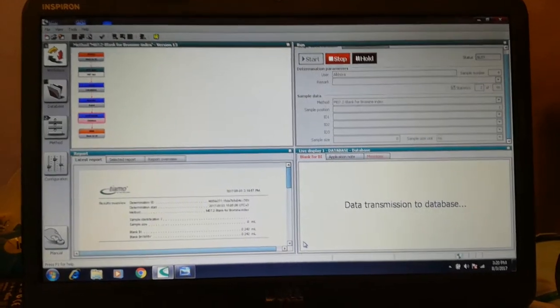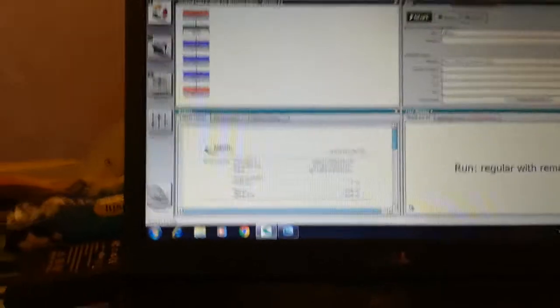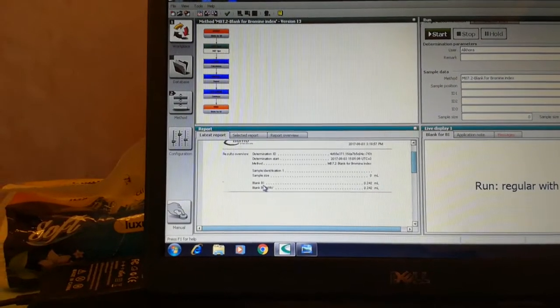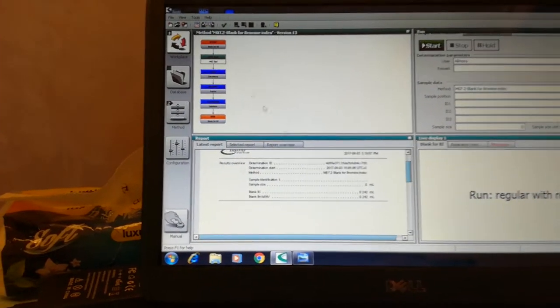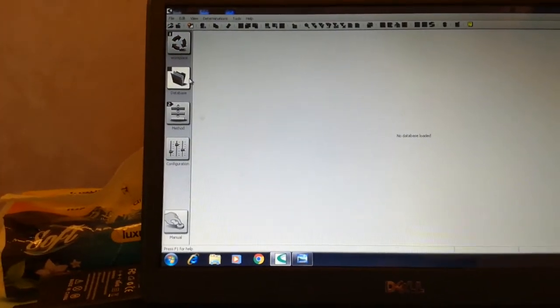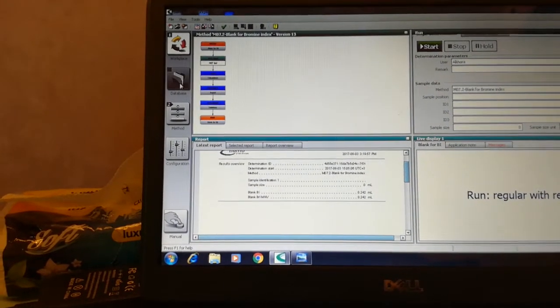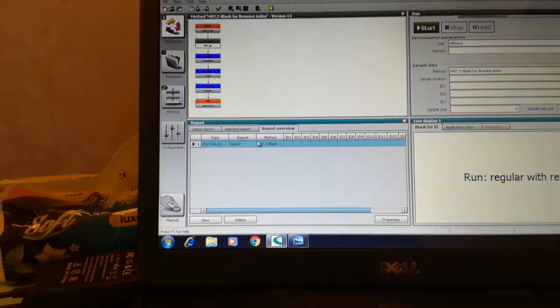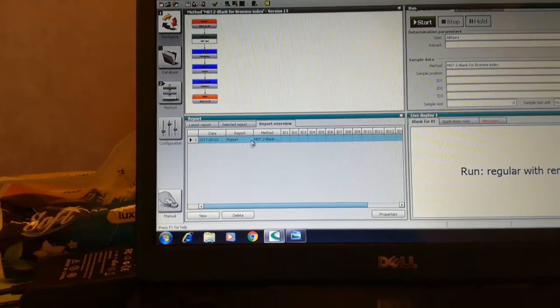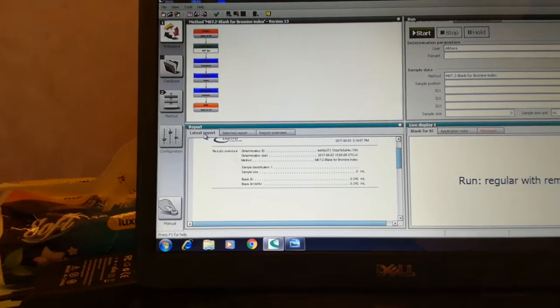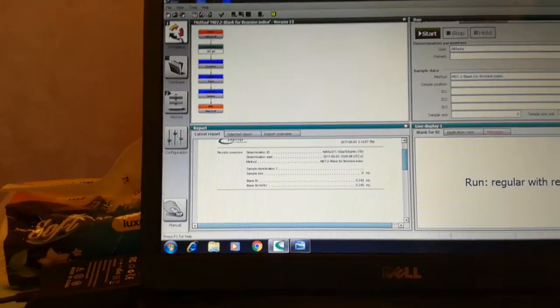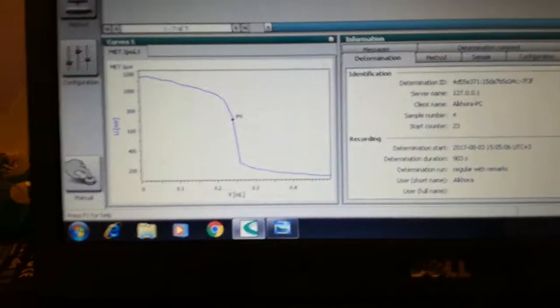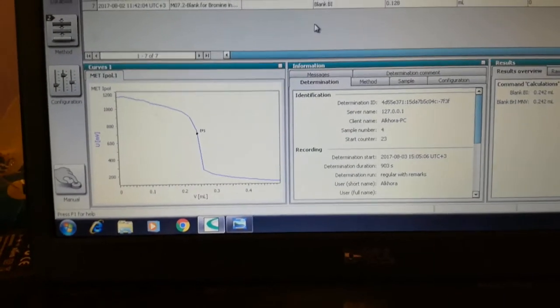The titration has been finished and this is the report we obtained. You can see from the report that the blank bromine index is 0.242. These are the information of the blank test — this is the method, sample configuration, messages if any, termination comments, and the graph.